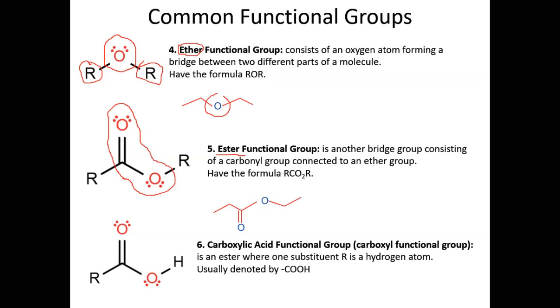And so this would be an ester. Because again, what you're looking for is this C double bond O group. So this is the ester group. And again, esters occur, the ester group occurs somewhere in the carbon backbone. It cannot occur at the end.